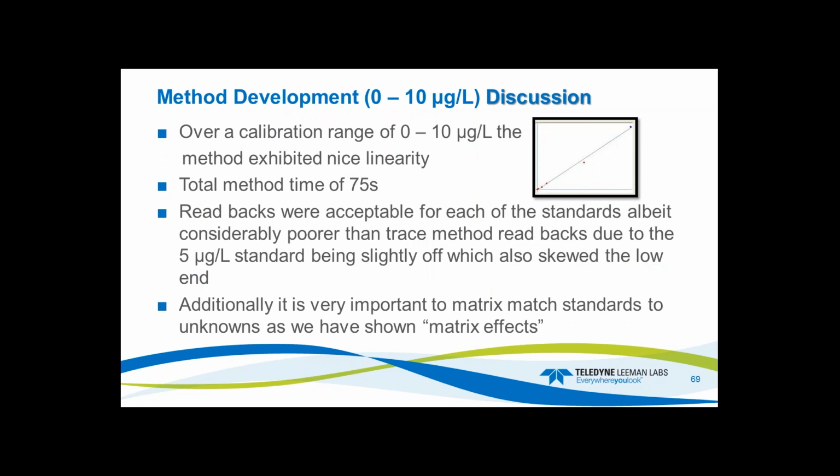So over the calibration range of 0 to 10 ppb, the method did exhibit nice linearity. The total method time was 75 seconds. Readbacks were acceptable.